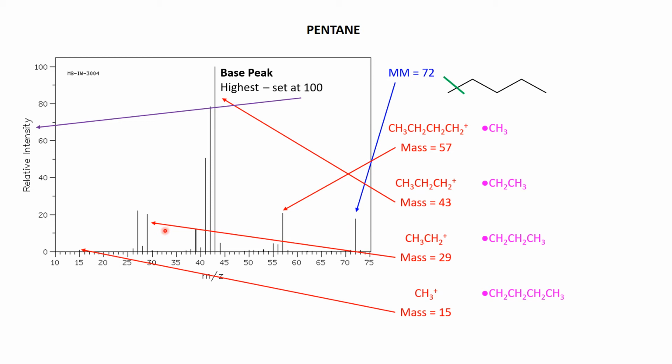So we've assigned a little peak, a poor excuse for a peak, and three of the fairly decent sized ones, and then the base peak, simply by thinking about how a 5 carbon chain is going to fragment. Now I said we're not going to worry overly about a lot of the peak heights, but it is rather significant that there's the molecular ion, and then 57, 43, 29, all sizable peaks, and then here's this 15, a ridiculously dinky little peak.